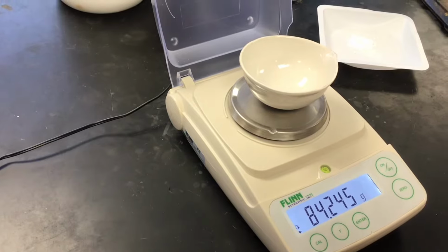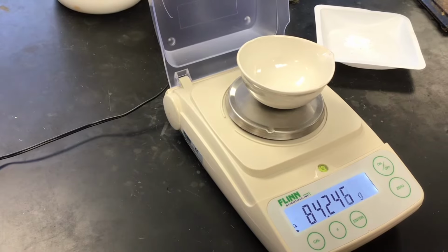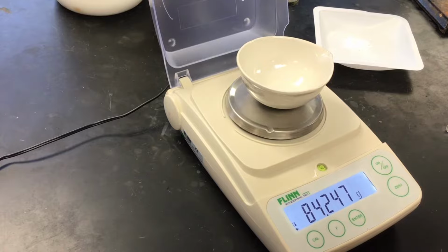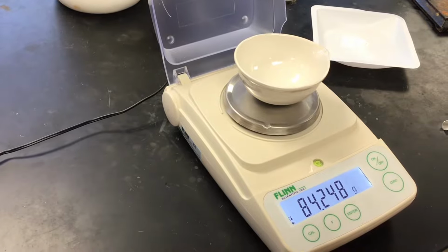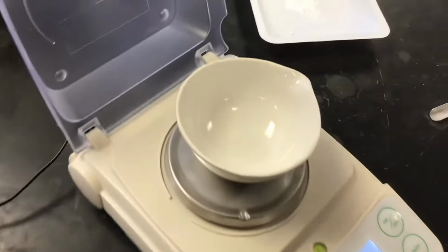Just when I think, okay, we're done. 84.248. We're going to stay with that. I think that's pretty close. Okay, so that's the mass of the empty evaporating dish.